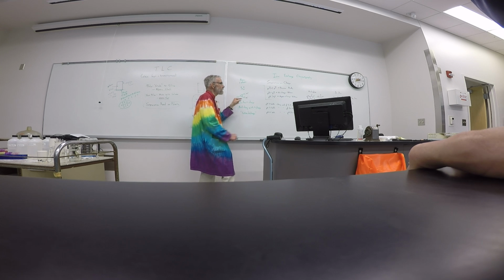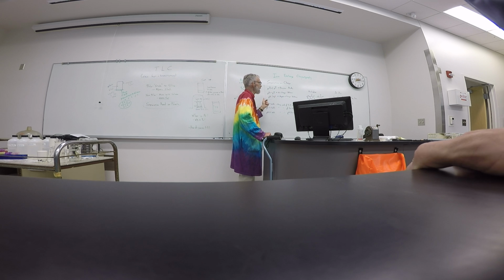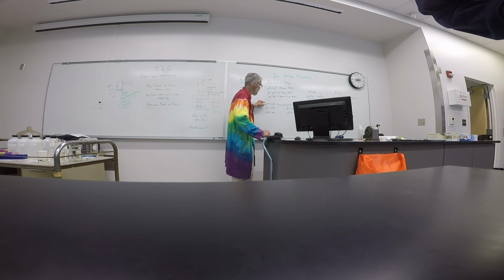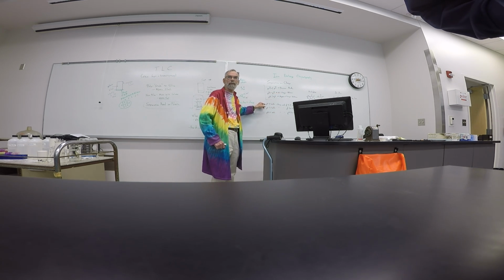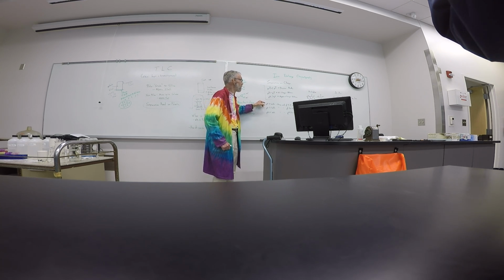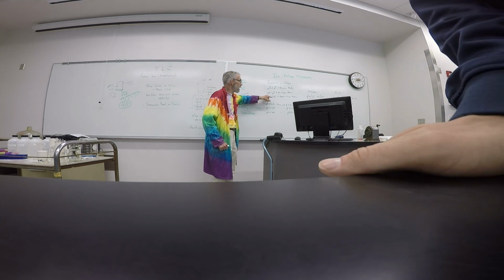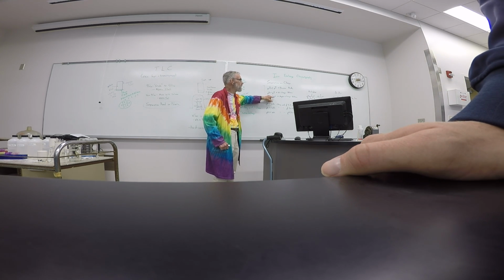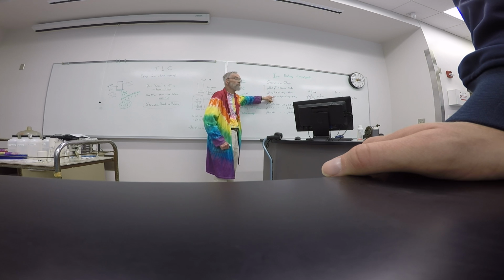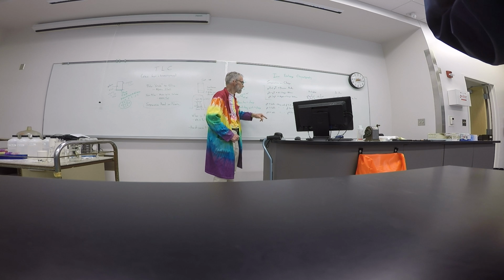So what you're putting on is a mixture of these three different amino acids up there, and depending upon their pI, what you start off with is you're washing it with a pH 3 buffer. And in the pH 3 buffer, for the things with the lowest pI, even at pH 3, the pH might be greater than the pI. So if you've got a really negatively charged amino acid, it might be coming straight through because it's not bound. And so that's what should come off first.